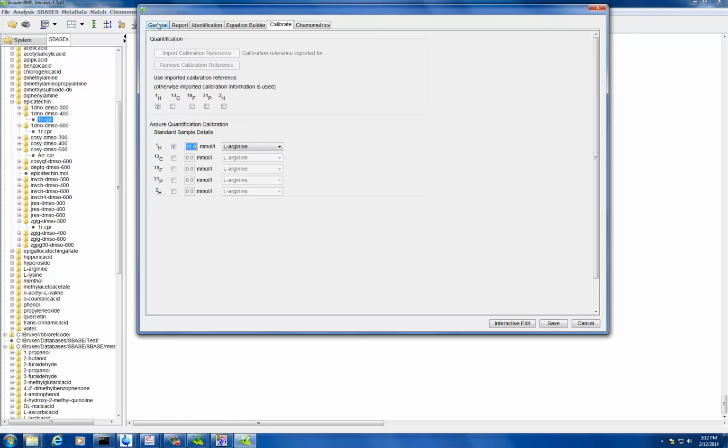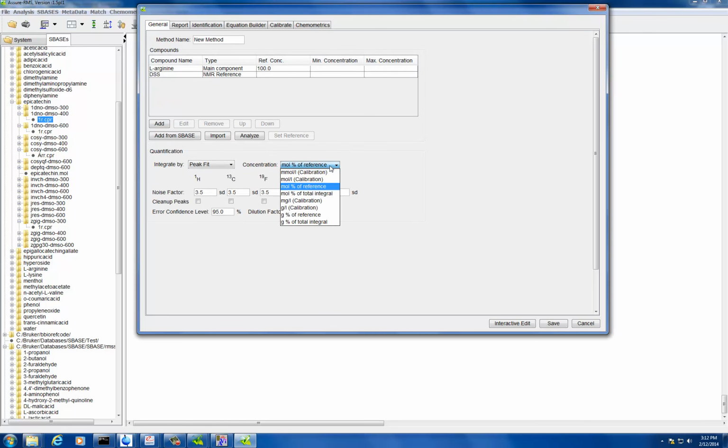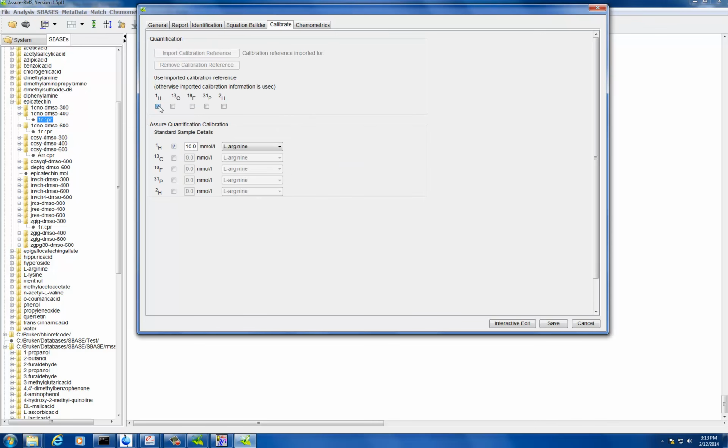This is the concentration. How do you know it's 10? Well, not just that, I also have my standard that's sealed. So you know it's 10 millimolar. Oh, that's your standard. Whatever your own concentration is, you put that as the mole reference. The calibrate is only when you're actually going to calibrate from something. So, mole reference, calibrate. You don't click on that.